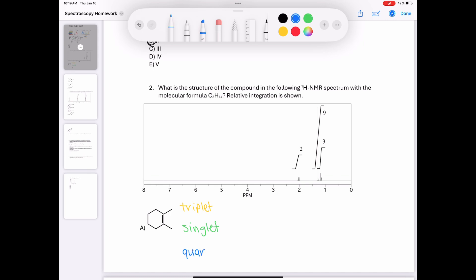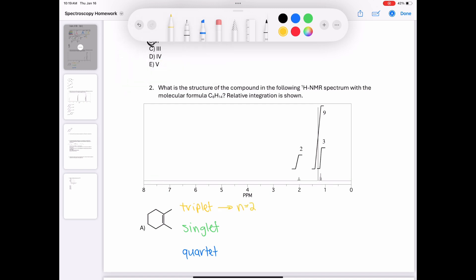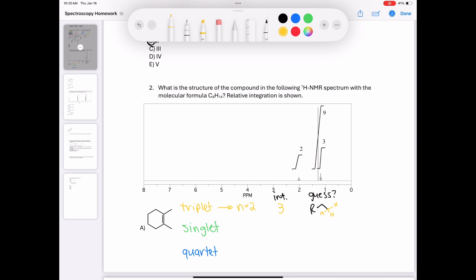For the triplet, I'll try to guess what it's indicative of. Because it integrates to three, is around 1 part per million, and has an N value of two, I'm going to guess this signal is indicative of an ethyl group. When you have an ethyl group, you have a primary carbon with three protons directly adjacent to a carbon with two protons — so there are two neighbors, which means the splitting pattern would be a triplet.